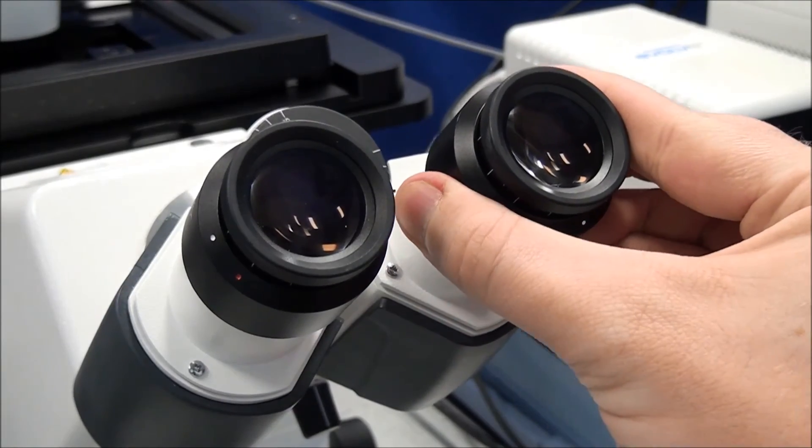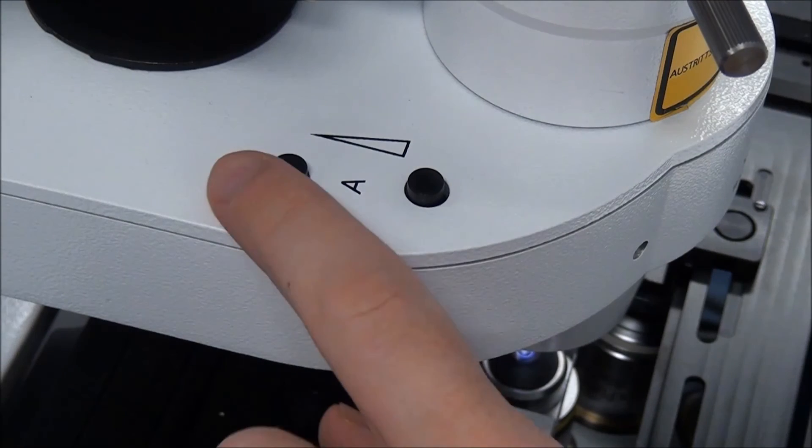Remove one eyepiece. While looking down the binocular tube, close the aperture diaphragm, located on the condenser, to about two-thirds the size of the illuminated view. Replace the eyepiece when complete.